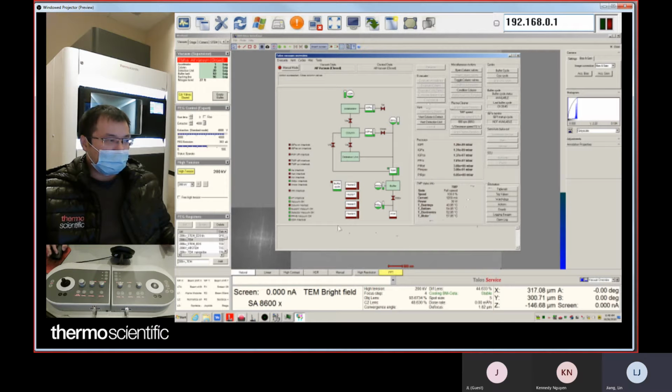I recommend that when the machine is running perfectly, you take an image of this interface to record all the values. Then you know the ideal value for the different pumps.